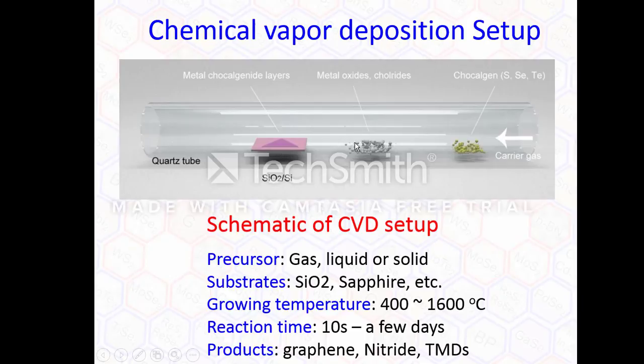For the precursors, for TMDs, most of them are solid precursors, which means it's a complicated process. Is it a solid reaction or a solid-gas reaction? There's no good answer so far, but some people are working on this. What we believe is that it involves gas or small particles and some nanoparticles. I'll show you what will happen.